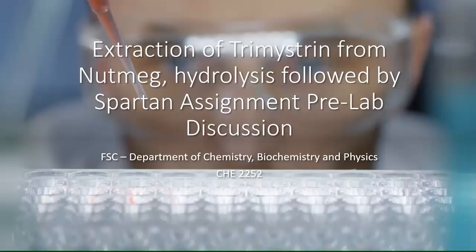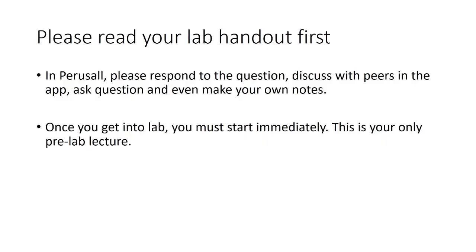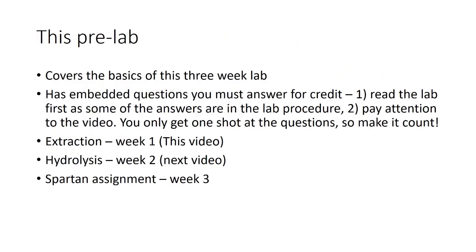In this lab, you will do an extraction from nutmeg, followed by a Spartan assignment. Please make sure you read your handout before coming to lab and be prepared with your notebook complete of the lab.